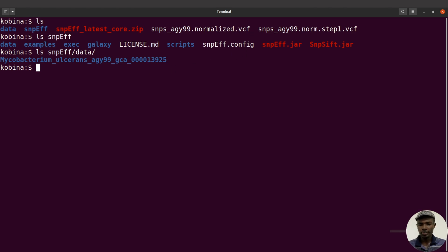So now I can proceed. So I'm going to run snpEff now. So I'll say java -jar, and then I'll specify snpEff jar. So there's the path. And then I'll specify the option. So I'll start with ANN, and then I'll say -noLog. I'll say -noStats.